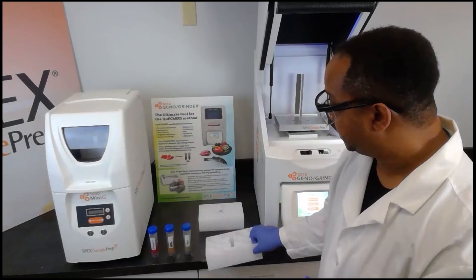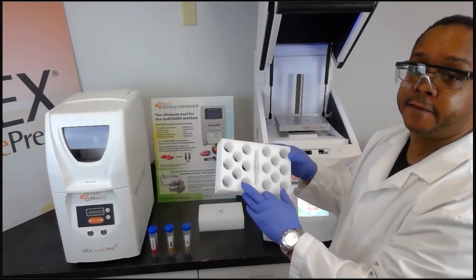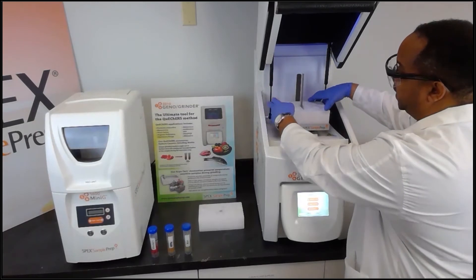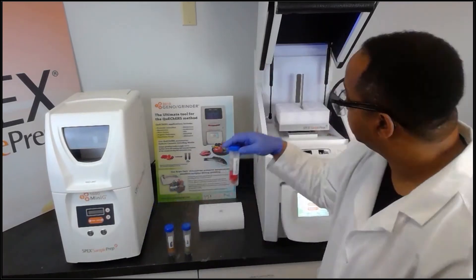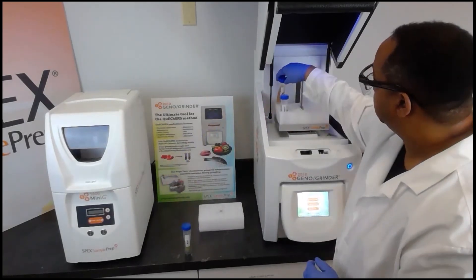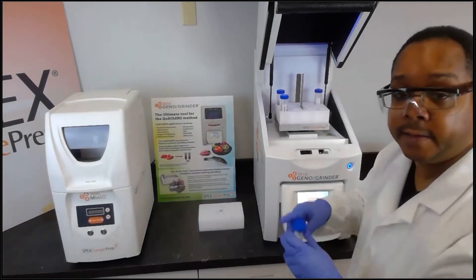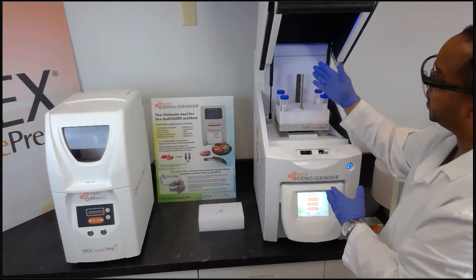I prepared the apple and the kiwi ahead of time, so now we want to add our sample tubes to the GenoGrinder. Here we have a foam holder which can hold sixteen 50 milliliter tubes — we simply take the foam holder and slide it over the threaded rod down to the base. Since we're only running three samples, we want to place each sample in a corner of the holder in order to balance the clamp.